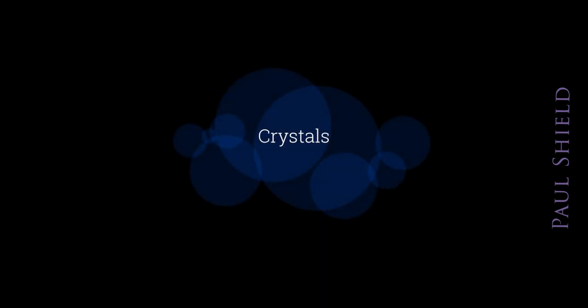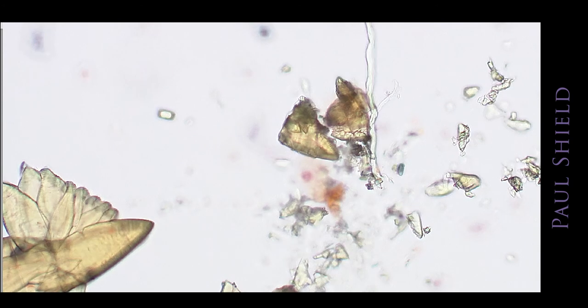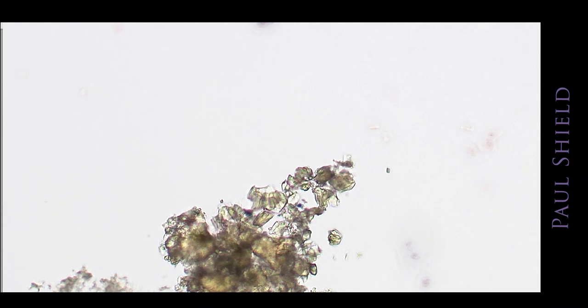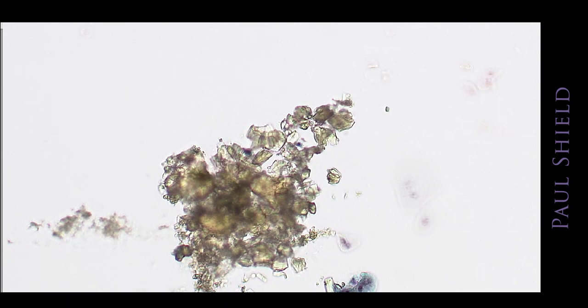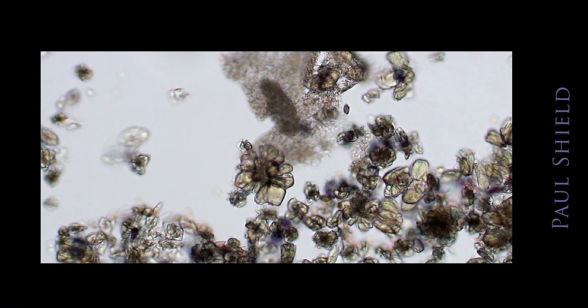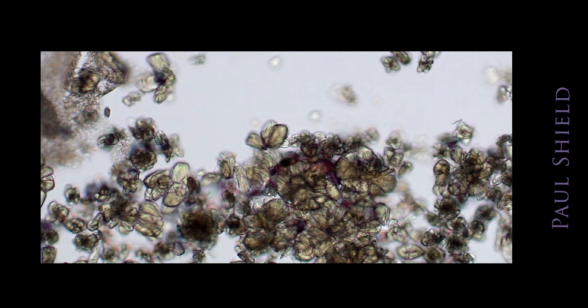So crystals are just really an incidental finding in most urines, and they vary enormously. Here's one that looks a bit like a moth down the bottom left there, and these we don't report. These are really cool under a polarizing microscope where they do sort of rainbow colors, but I didn't have a polarizer at hand here at the moment.